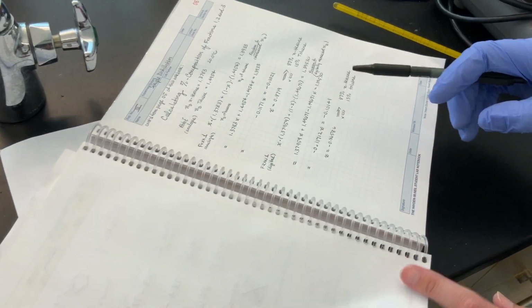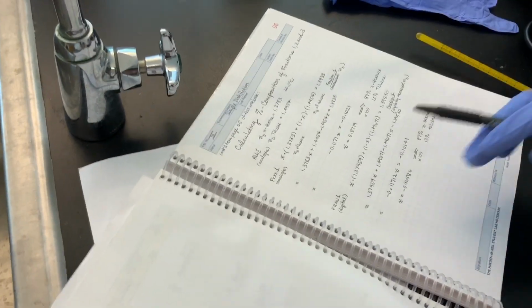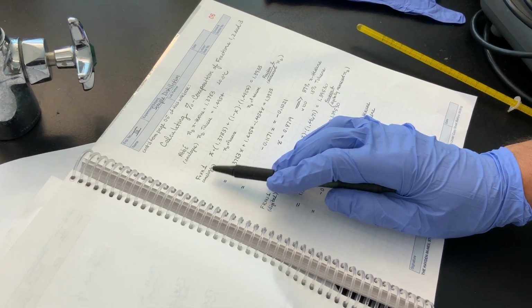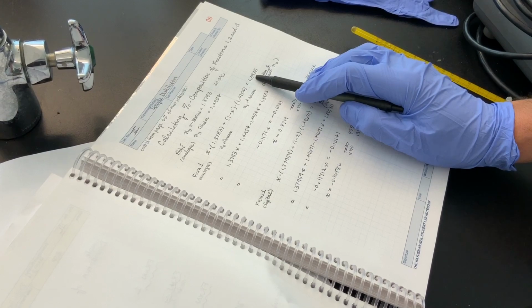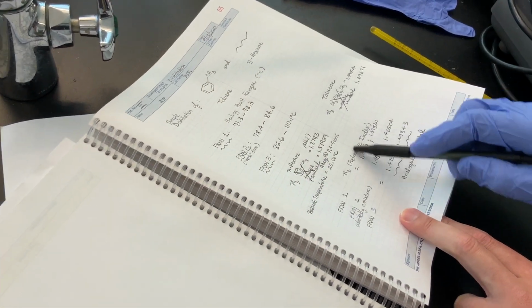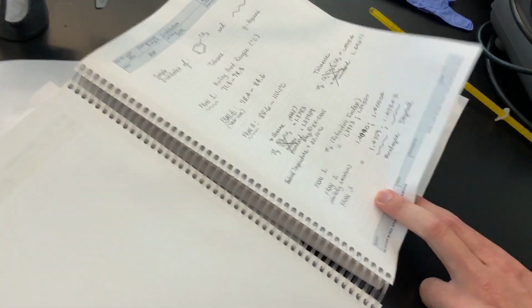So using that equation, we can just do some basic algebra here. Fraction number 1, the analog one, remember we measured to be 1.3933. That's what we measured for fraction 1's refractive index.